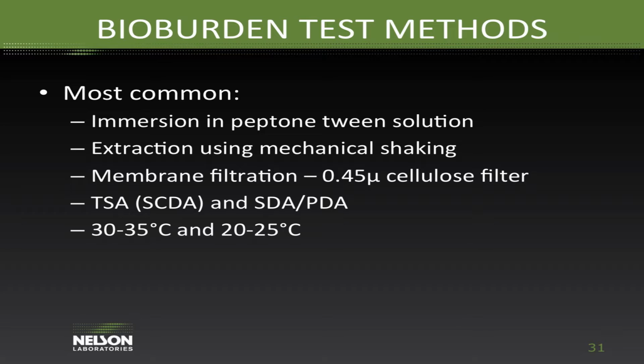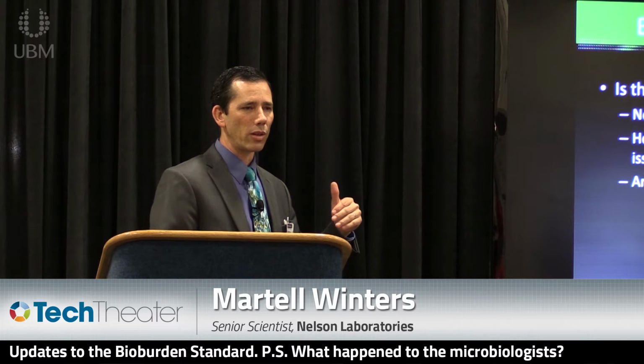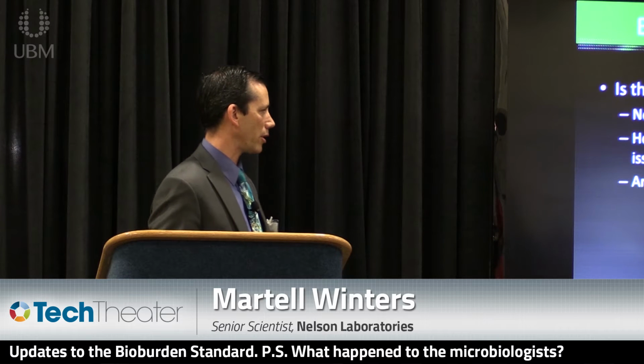Now, the question that we're asking, and this goes back to having fewer microbiologists involved in these processes. If you call a lab and say, what should I do for my bioburden test? What I just explained, that's the answer you're probably going to get. This is what everyone else does, this is what you should do too. That is not always the right decision for your product. More often we find when we dig into a manufacturer's process or a manufacturer's raw materials or components, we often find that there are different things that we should be doing which would be better suited for your situation.